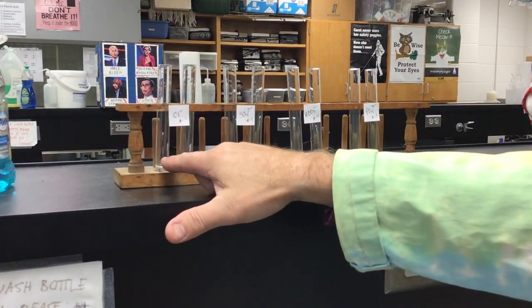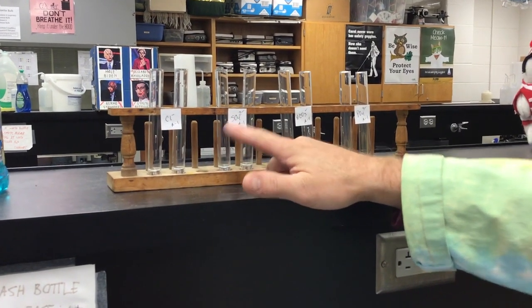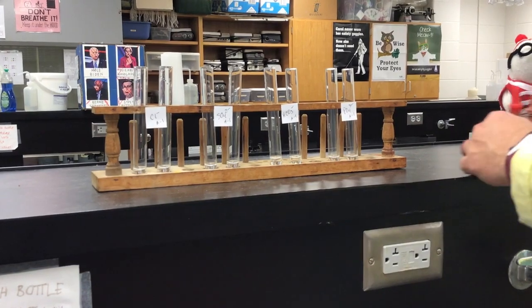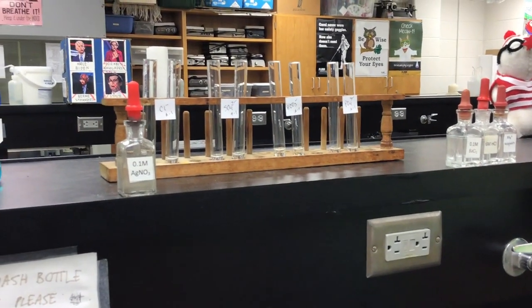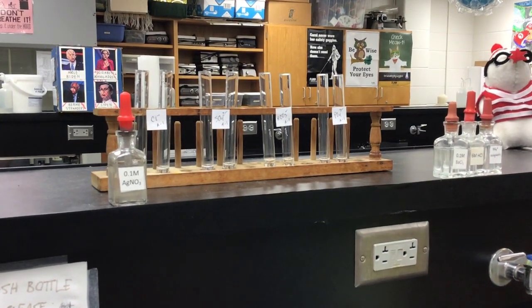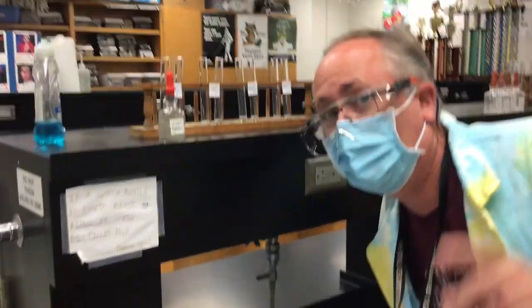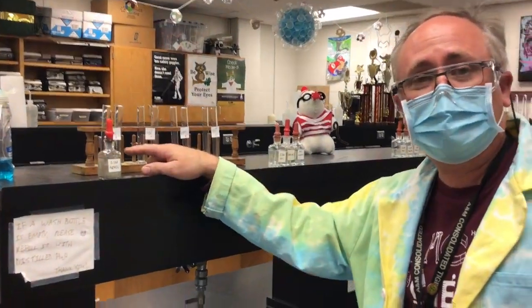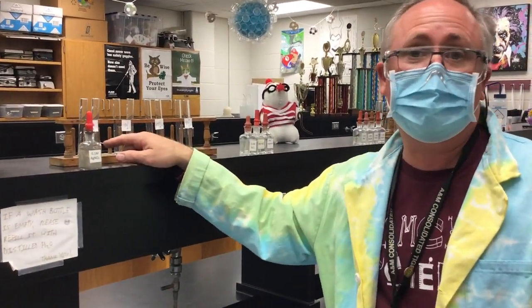We have already put all of these in each of the test tubes. So in the first test tube is our known, and the second one is unknown A1. This one has a known, and then unknown A1, and so forth. And then these are the ones that we're going to test it with. So for the first one, we're going to add silver ions to our solutions and see if chloride is present. You're looking for identical test tubes. If you want to have the exact same ion present, the solutions need to look exactly the same.